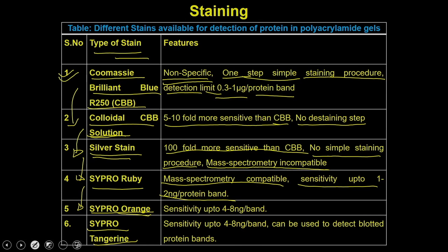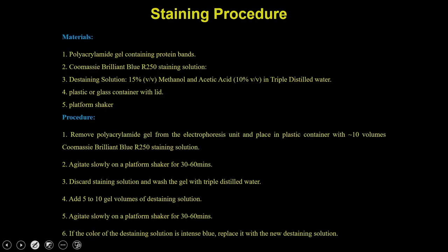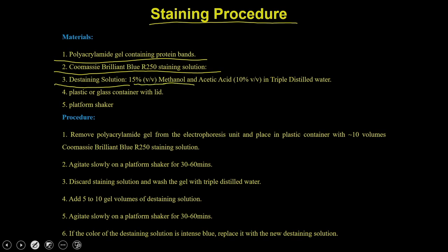For staining the gel with Coomassie Brilliant Blue, the materials you require are the polyacrylamide gel which contains the protein bands, a Coomassie Brilliant Blue R250 staining solution, and a destaining solution. The destaining solution contains 15% methanol and 10% acetic acid, all prepared in triple distilled water. You also require a plastic or glass container with a lid, and a shaker.